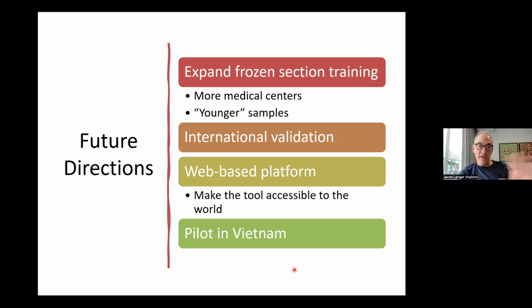And then the other thing is the frozen section application while surgeons are doing surgery. And I think, Eric, that's what you were talking about before, is you have to do multiple frozen sections, and that's where accuracy is more of an issue.